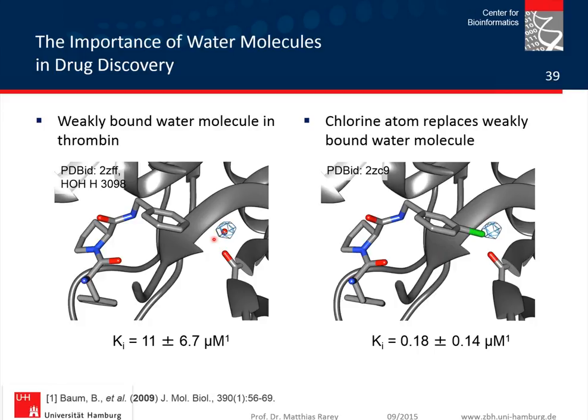So it is important to actually compare the water positions with the electron density of the crystal structure. So here everything is fine. The water molecule is here. You see the cage here, which represents the electron density, which clearly shows that there's a water molecule at this point.